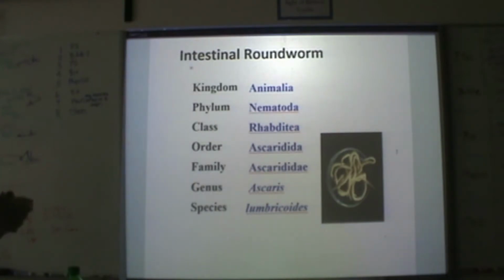Partway through the ascaris one, it will break. The person doing it, she doesn't actually stop, but the video will stop, and I'll break it into letting you see the worm in its natural environment a little bit, kind of in its natural environment, you'll see.